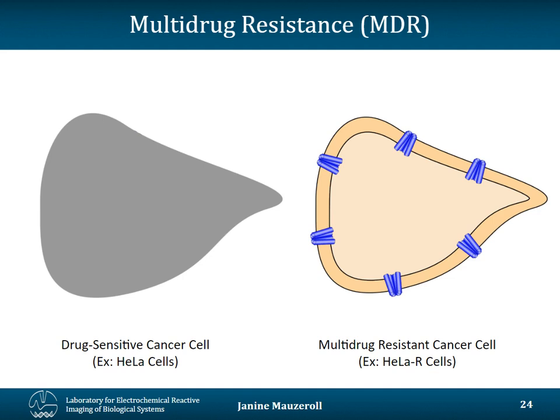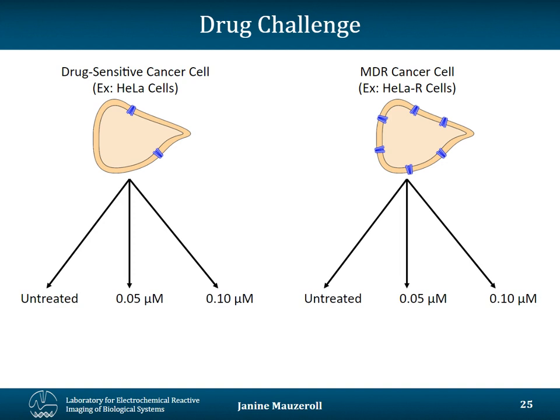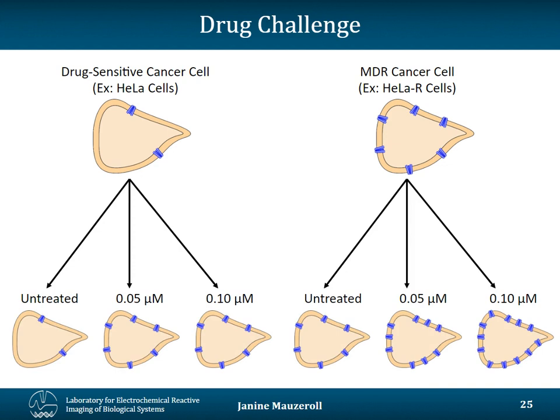So we wanted to see if SECM could be used to monitor the functional activity of these transmembrane proteins. And so we drug challenged the cells. We drug challenged cells that were not resistant on the left-hand side and cells that were resistant. So we generated a population of cells that had different MDR phenotype. Next.